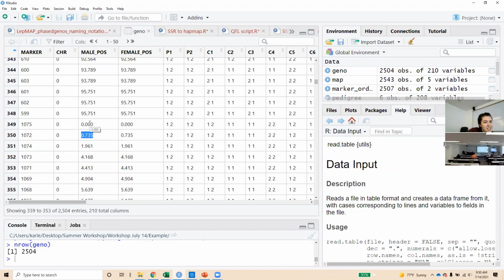And so it would move on to that second part of the statement and see if this value is larger than this value. And if it's double zeros, they'd be equal and not greater. So just in case there are more than one 0, because that does happen sometimes.